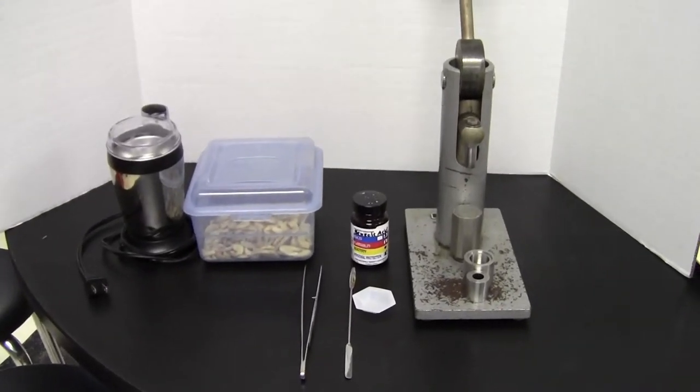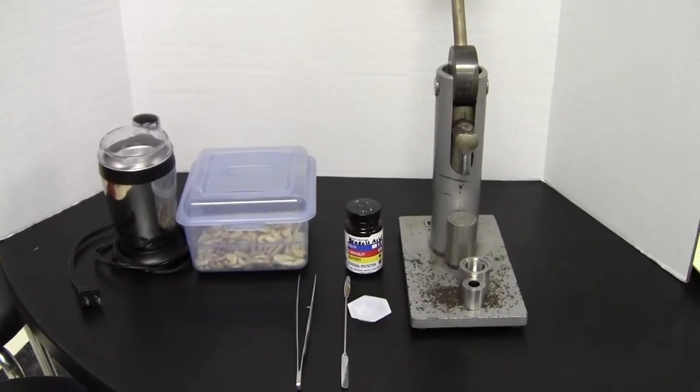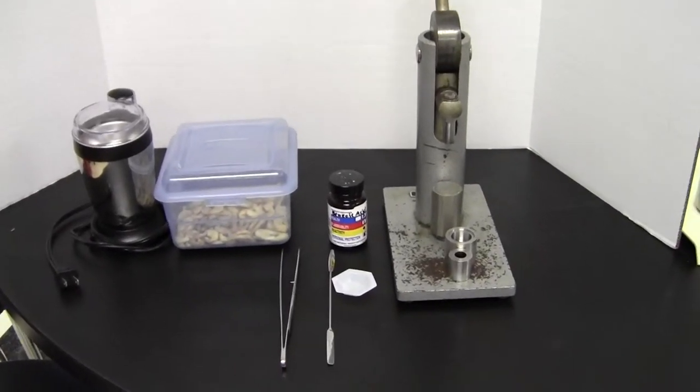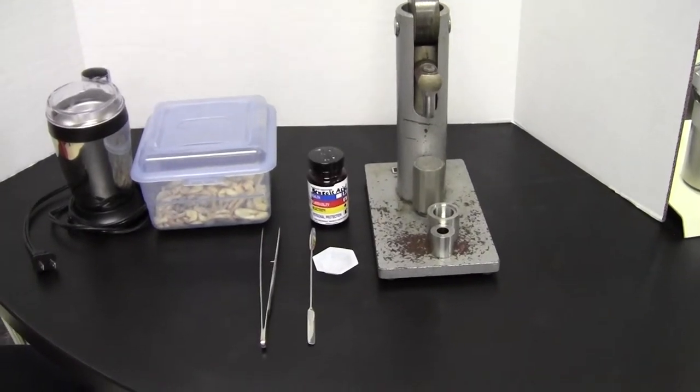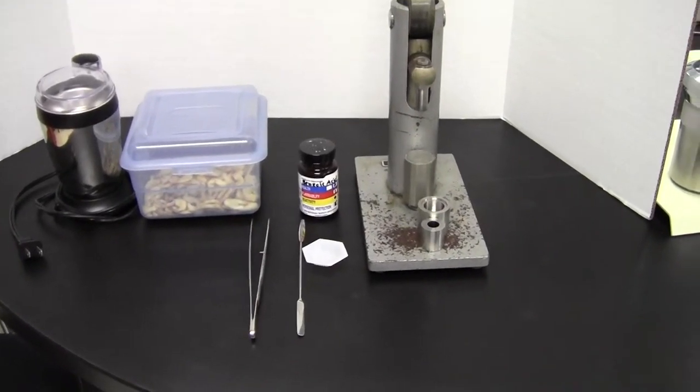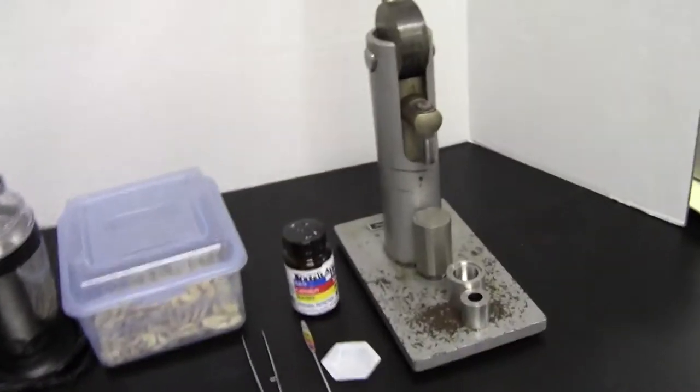All right, we're looking at the setup for the Bohn calorimeter lab, just the part where we make the sample. You'll begin with your standardized run and you'll be making a sample of benzoic acid that's in the jar, and then we'll be using this press to actually make it into a pellet.